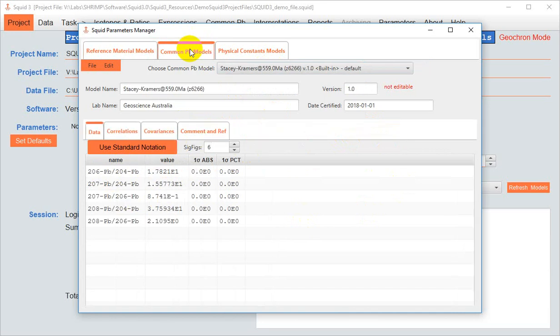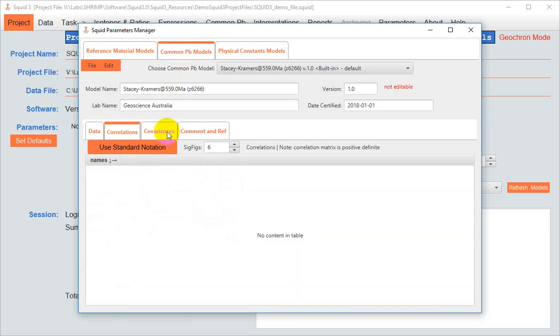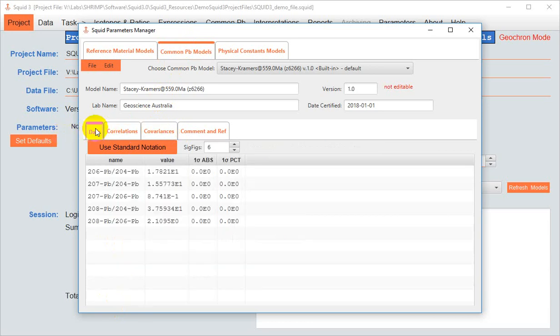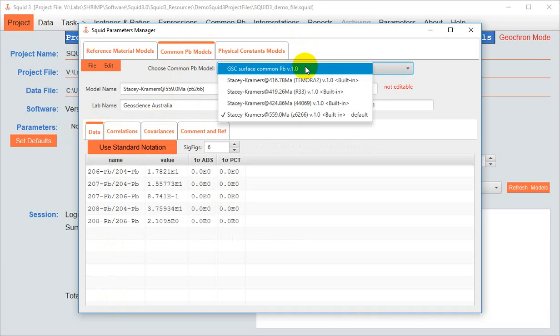Common lead models, at a minimum, contain the five lead ratios. The other tabs containing data on correlations and covariances are blank, and that's fine. Remember that the common lead model is primarily used for you to select the common lead composition to use to correct your reference materials. You might also have common lead models that you'd like to apply to your unknowns.